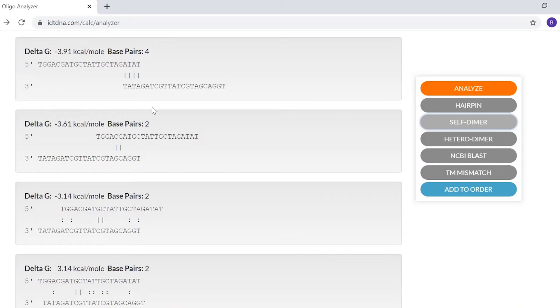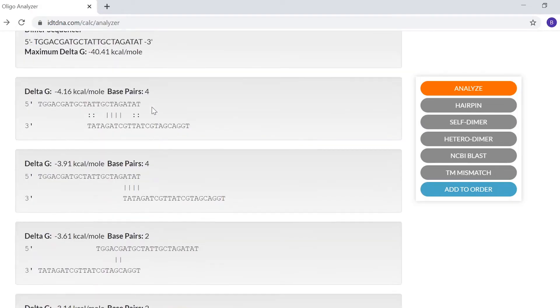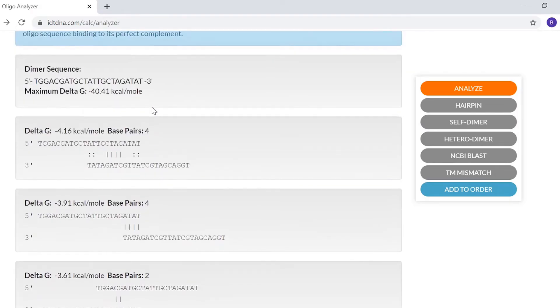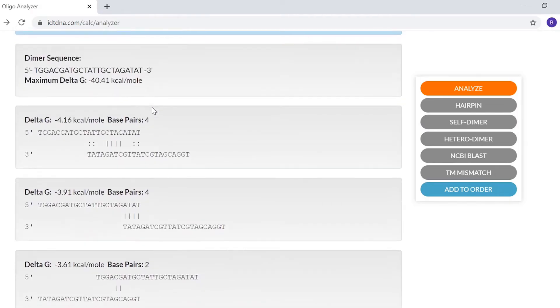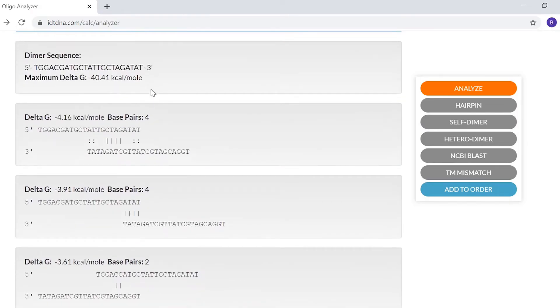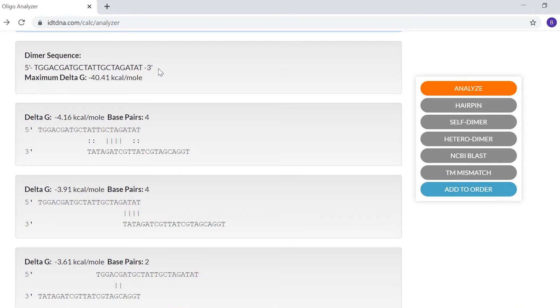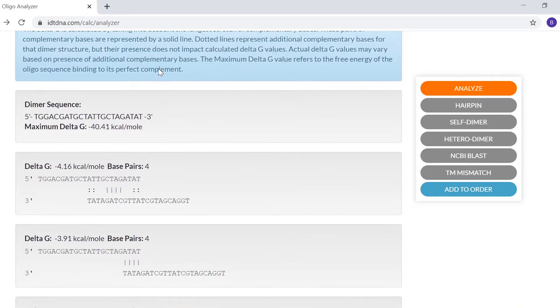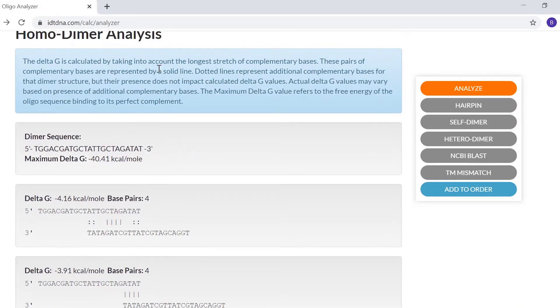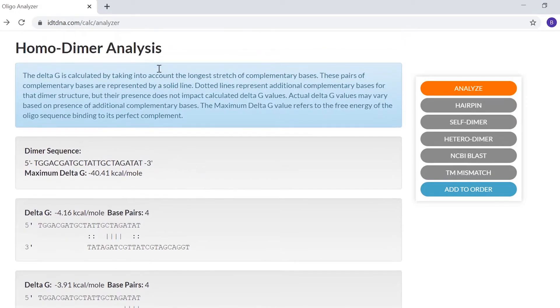Note that the max delta G is also given. This is the delta G calculated for Oligo binding to its perfect complement. The further this value is from the dimer value, the larger fraction of Oligos that will anneal to the target rather than dimerizing. The blue box above the structures also provides helpful information on dimers.